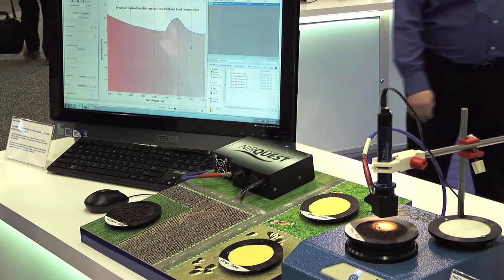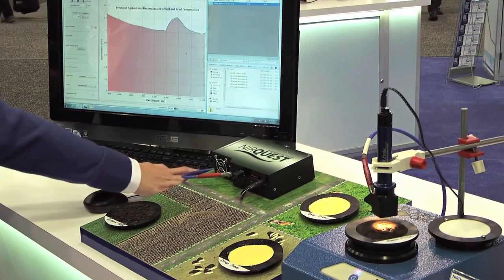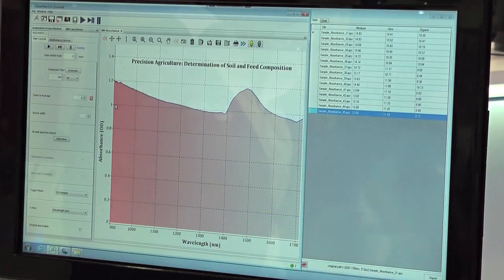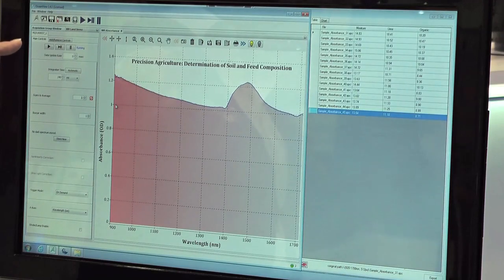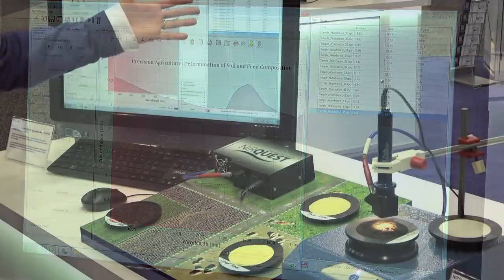To give you an example of how important this representative sampling is, if I decrease my number of averages so we're looking at a single point on the sample, we then will begin to see a lot of variability in our sample. And so we won't know what the actual values are for the moisture, urea, and organic content.